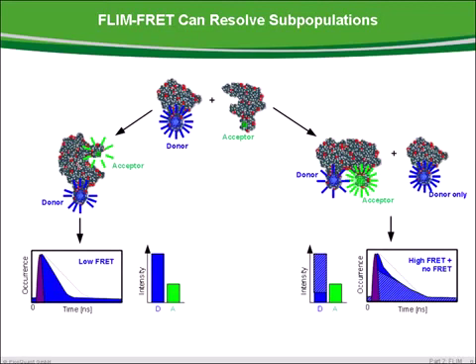In reality, however, we do not have only complete FRET molecules in one sample. Moreover, it will be a mixture of two populations, complete FRET molecules and donor-only molecules. FRET molecules with a higher FRET efficiency, together with donor-only molecules, will yield the same intensity ratio as a population of only FRET molecules which have a lower FRET efficiency. These two possibilities are indistinguishable by intensity FRET.